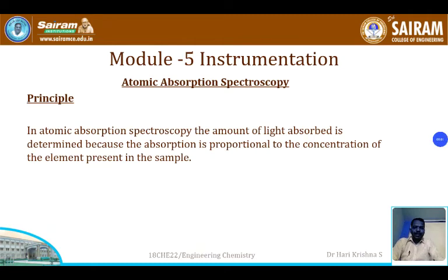In our previous session, we discussed flame photometry: how to determine the concentration of lithium, potassium, sodium, etc. So, this is similar to flame photometry, but somewhat different. How is it different from flame photometry?